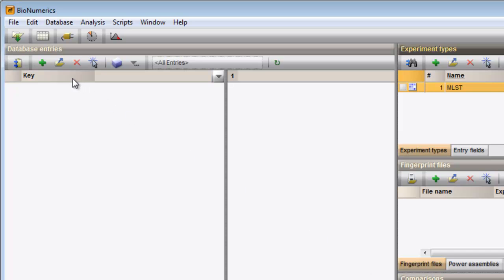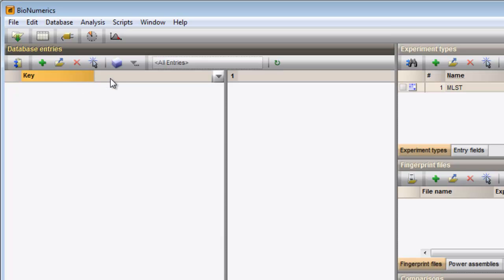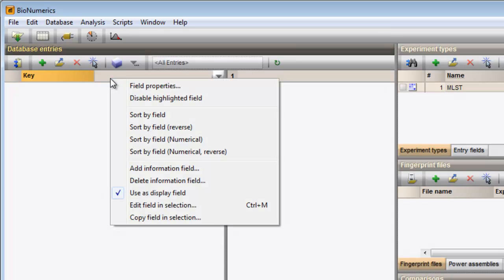The key field is the default information field. More fields can be added by right-clicking in the header of the panel or during import.